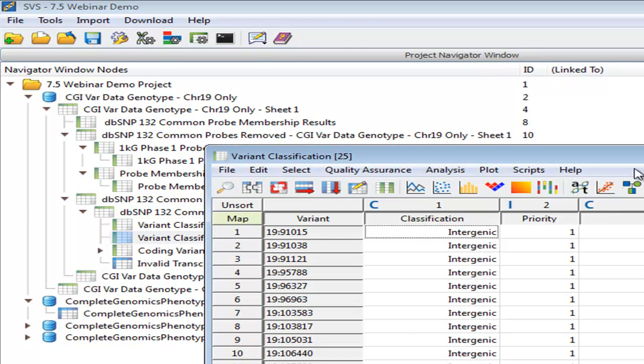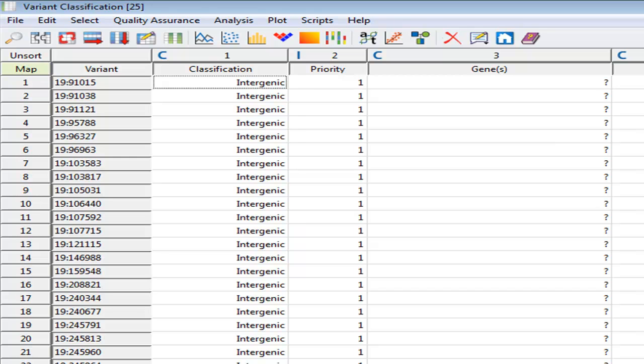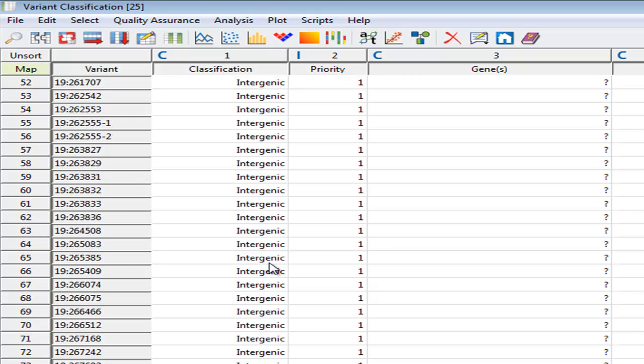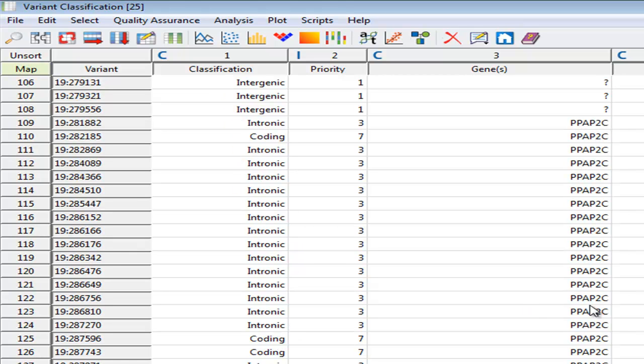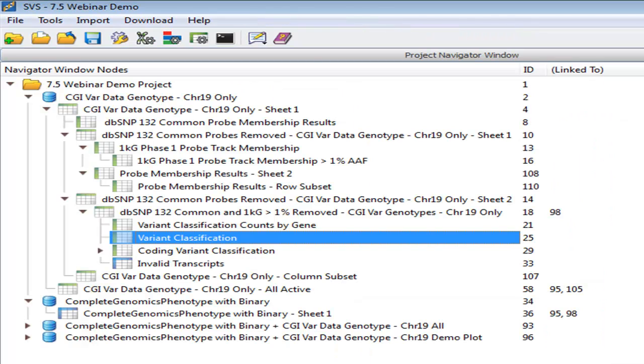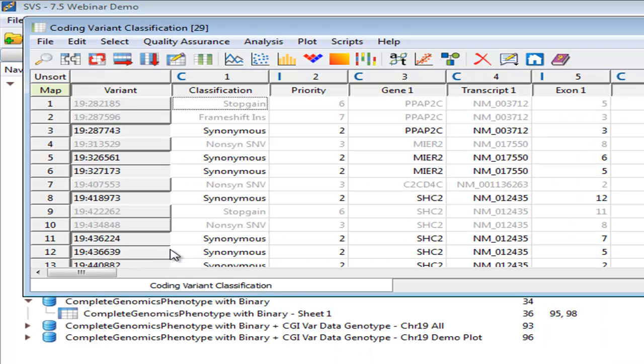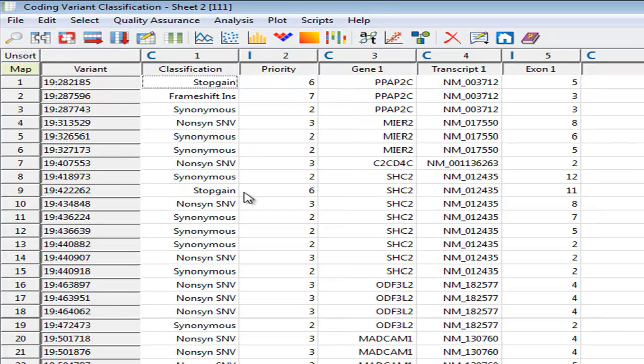This variant classification report will list every single one of those variants, 225,000, and classify them in the context of genes. And as you can imagine with the whole genome data set, quite a few of those are going to be intergenic, but as we scroll down, we'll hit our first gene here. And then you can see that there are intronic and coding variants for this gene. Moving on to our next report, and again, there's quite a few different workflows that you could potentially use directly off of each one of these spreadsheets, but I'm going to have to move along.